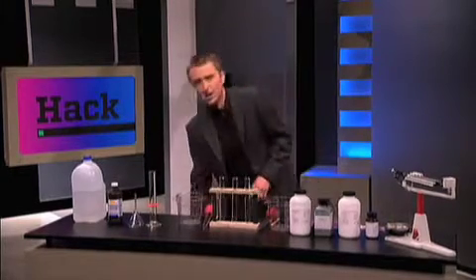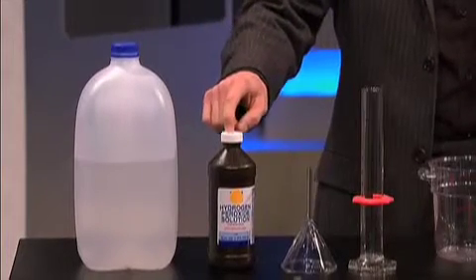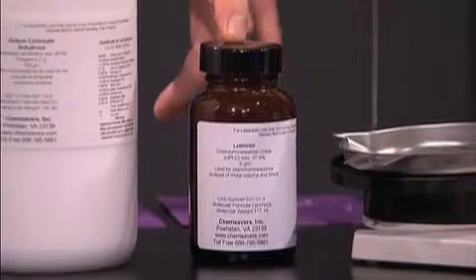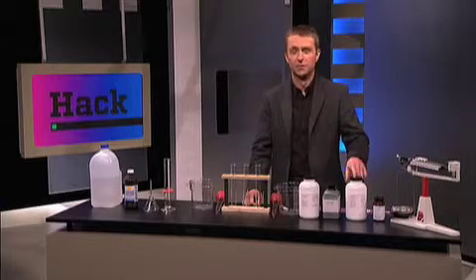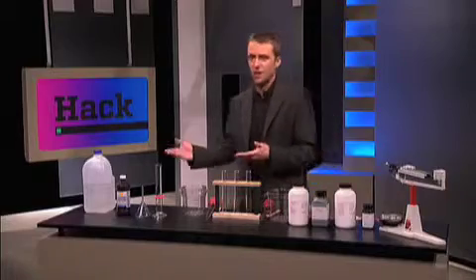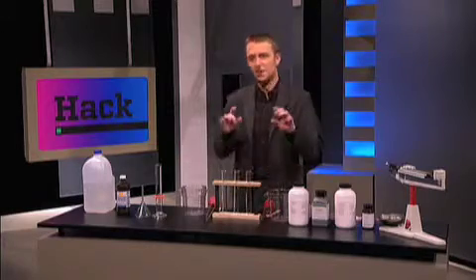All right, here's what you need. First, some distilled water, 50 milliliters of hydrogen peroxide, a funnel, because it's got the word fun in it. Then you're going to need some luminol, which you may have lying around the house if you work on CSI or you're creepy. Also, some sodium carbonate. Then we have some copper sulfate pentahydrate, and of course, ammonium carbonate. Now, the hydrogen peroxide and the distilled water you can get at a drugstore. The other stuff, you got to dig around like a rat on the web and find it that way.